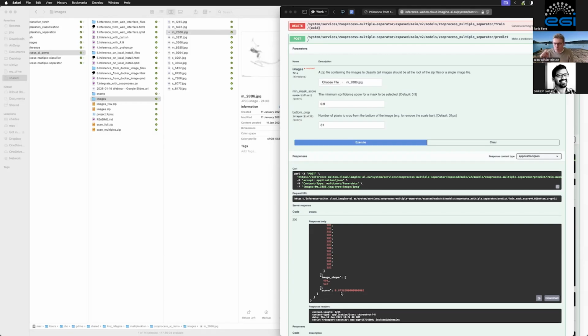Okay, so what you see is that starting right now with just a web browser, you can use these two modules by just clicking around, okay? Of course, when you use the ZooScan, it doesn't produce just one image, it produces many, so you don't want to be uploading many images this way. There's the zip file solution, which you can already upload quite a lot that way, but probably you want to access all of that programmatically, okay?